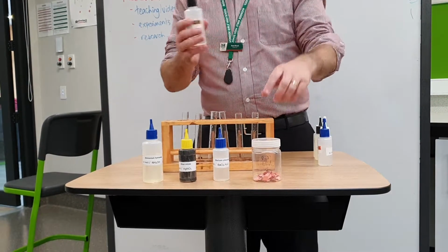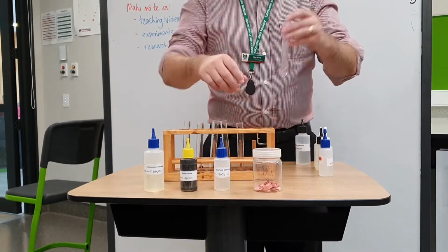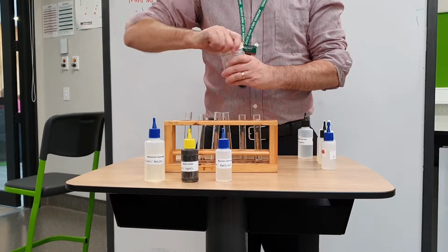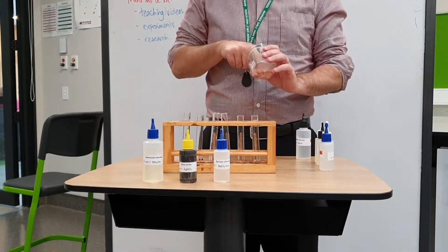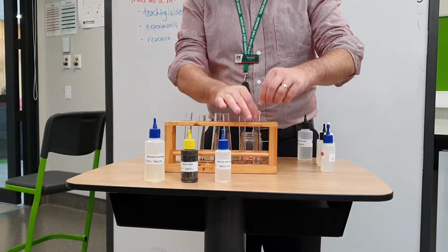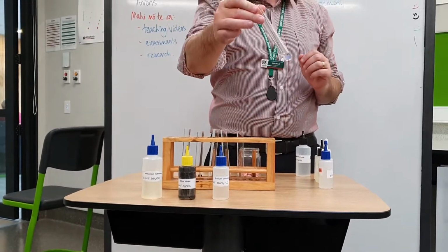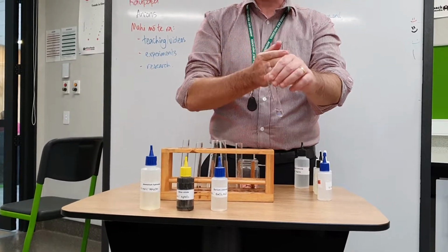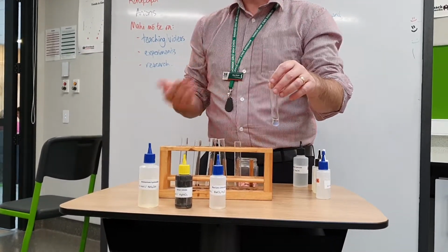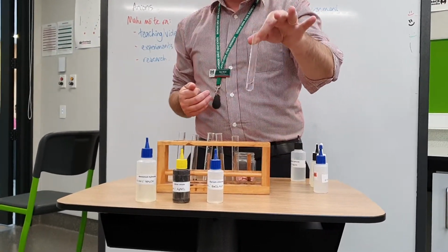So what I've got is some sodium hydroxide as my hydroxide solution. Now, with any unknown, you should put red litmus paper in it first. And here's where I hope this works without making me look silly. There we go. And if it goes blue, we know that it's a hydroxide or a carbonate. It's a base, and they're the only two anions we look at that are bases. So now I know that it's that.